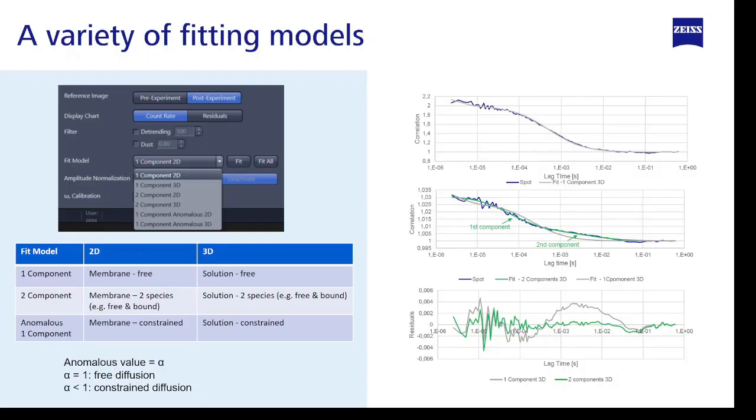And as we mentioned, we need to do the fitting after you get the correlation curve. In dynamic profiler, you don't need to do the model fitting by yourself. Mathematically, we include the most common models that people normally use for most experiments, so you just need to choose which one is suitable for you.